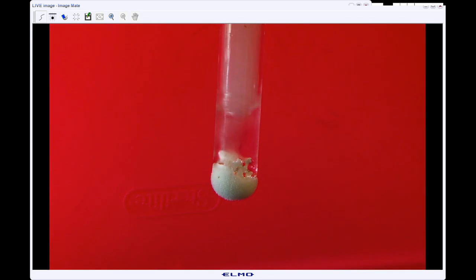As we focus in on that, so as the water was added, we can see that something is happening here.